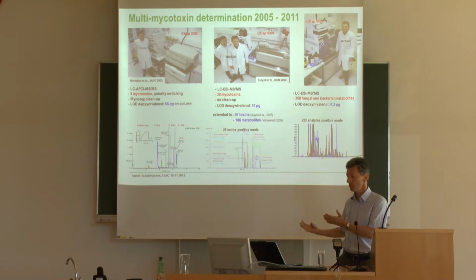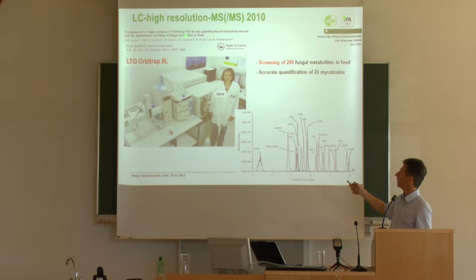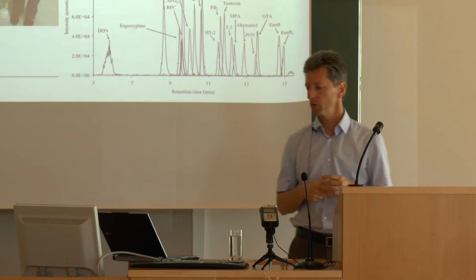We are now going high res. So recently, Sylvia, she performed also the first high-res FT Orbitrap MS measurements to detect mycotoxins in food. She screened for about 200 fungal metabolites. The purpose of this work was not to come up with a new world record, but to demonstrate whether or not high-res MS, and how easily or difficult that is to perform accurate quantification, and that was also found to be appropriate.